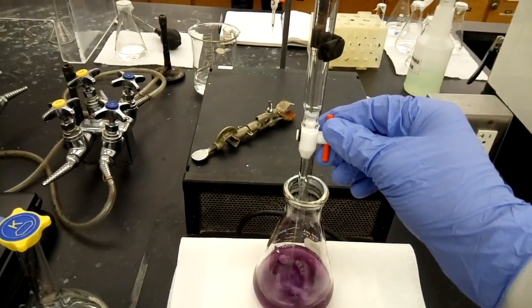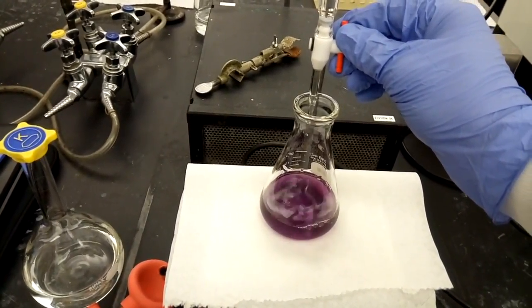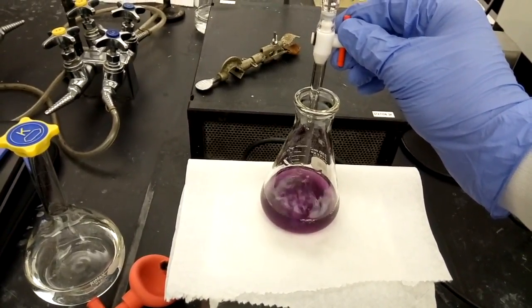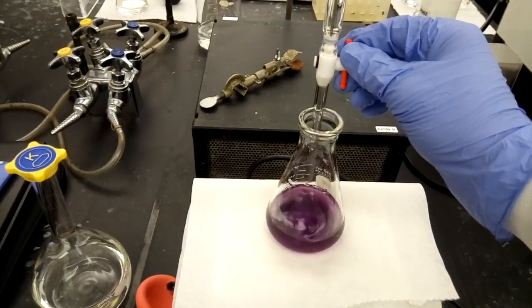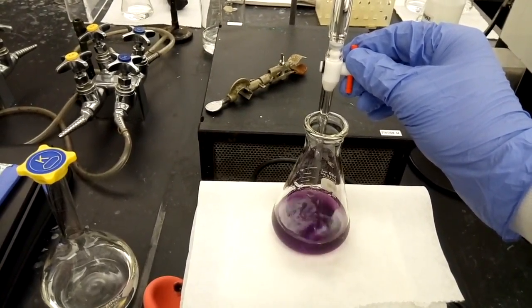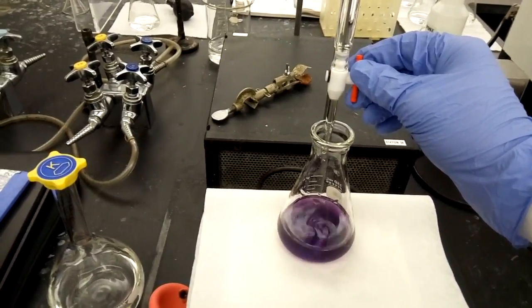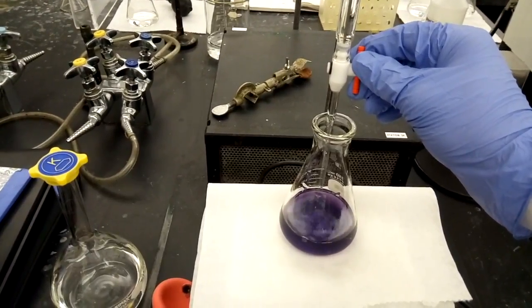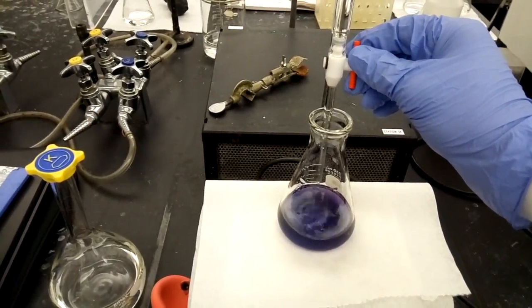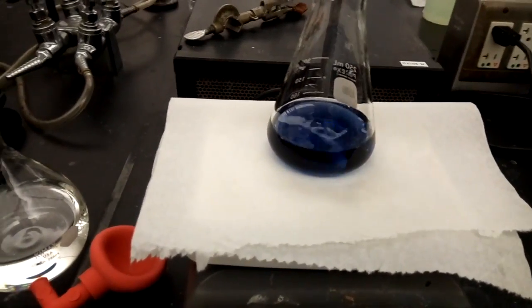Here we can see that we've had a slight color change to the red as we are nearing the endpoint. We will begin to only put in small amounts, drop by drop, while it mixes in and see if it will go to completion. As it gets closer, the color will become darker and darker, and we can see this as it gets closer and closer to the blue endpoint, and from there we will be able to calculate the equivalence point, and that will be when there are equal amounts of moles of acid and base in the analyte and in the solution.